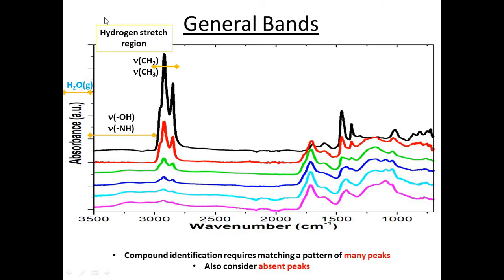On the left-hand side, what you mostly see are hydrogen stretching vibrations. These two very sharp peaks, those are typically stretching vibrations of alkanes.